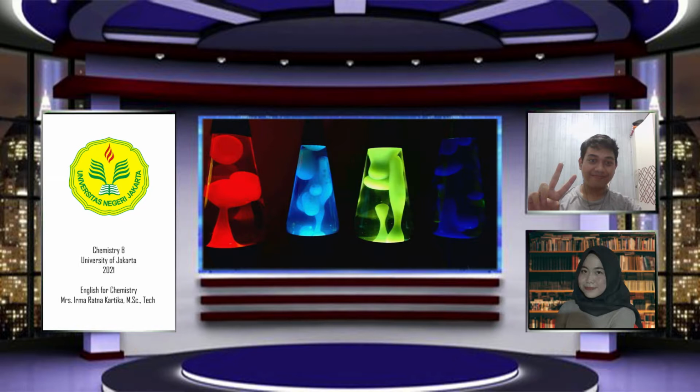We are from the State University of Jakarta, majoring in chemistry, class B. Today, we are going to make a very interesting chemistry experiment. Yup, it's a colored oil lamp.